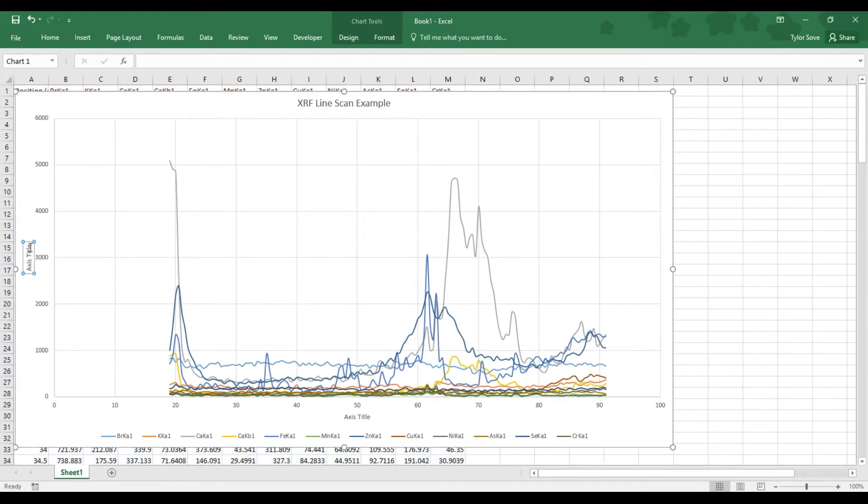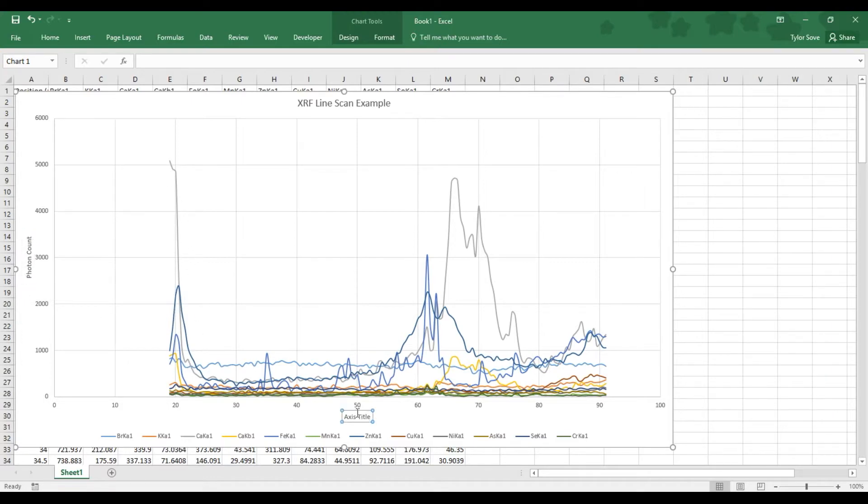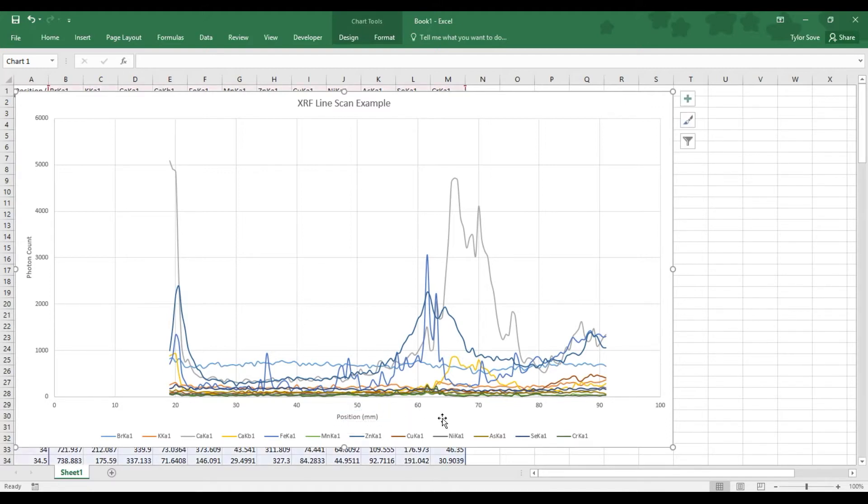And now, the Y axis is our photon count. The number of photons counted at each position for each element. Now, the bottom is our position measurement, where on the sample the measurement was taken. So, that's all the labeling we will need to do.